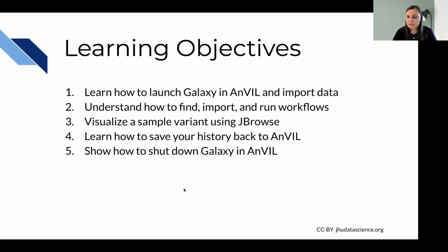Learning how to save our history back to AnVIL. So once we finish the analysis, we want to save our work and be able to free the resources that we use so we don't have to incur the continuing costs of the environment, and then learn how to shut down that interactive environment of Galaxy and AnVIL.